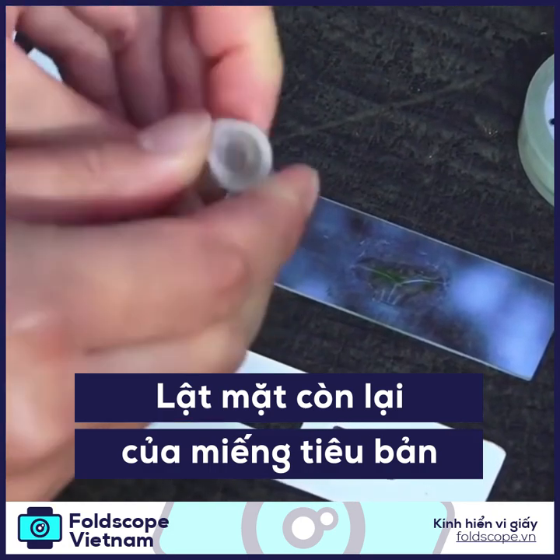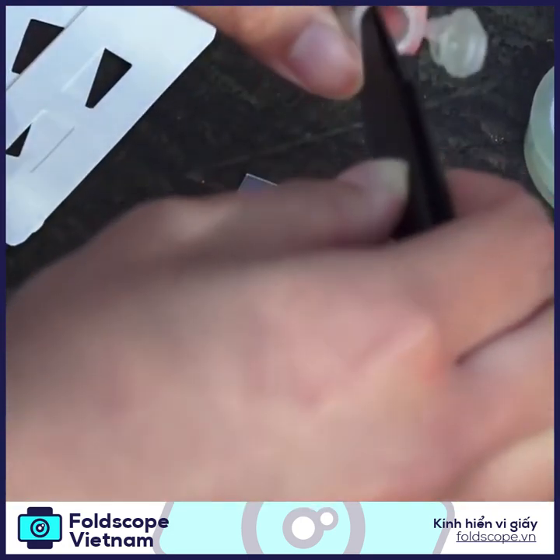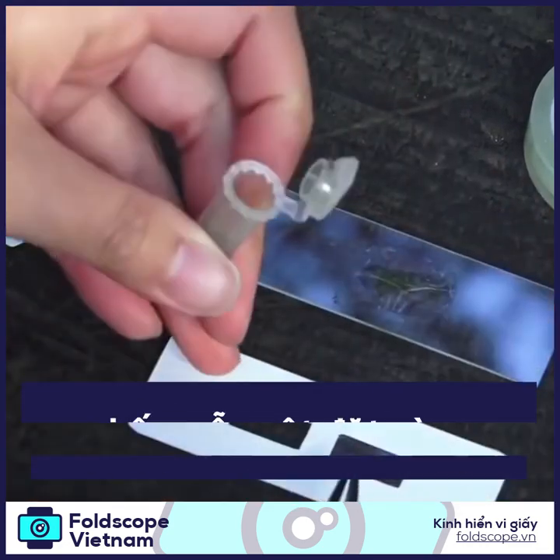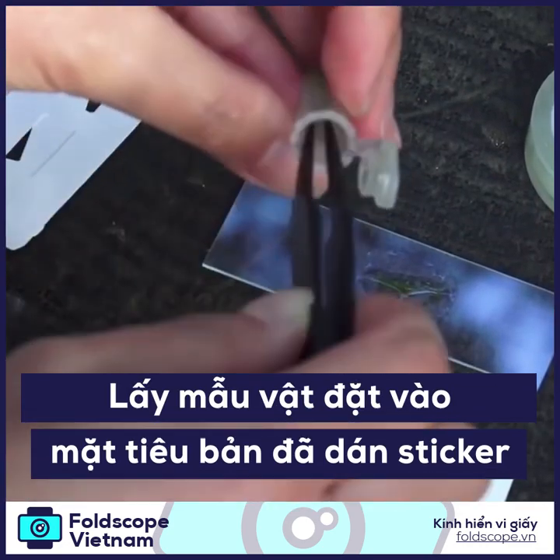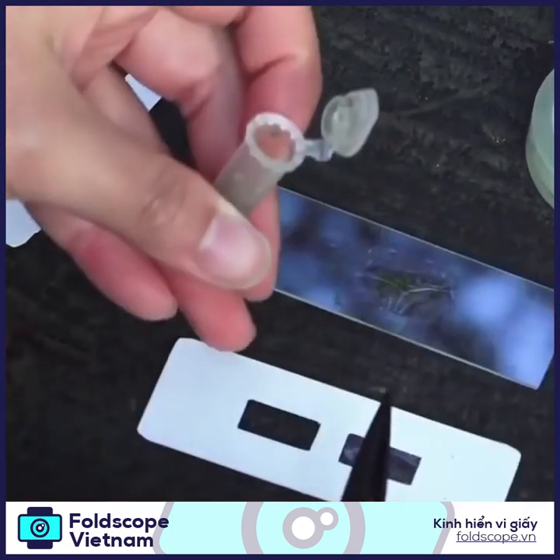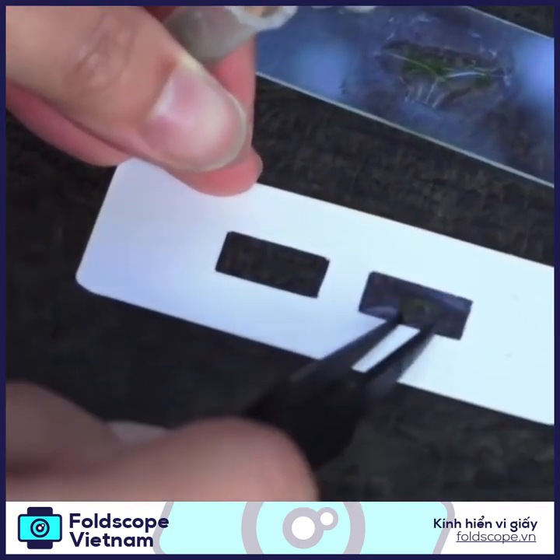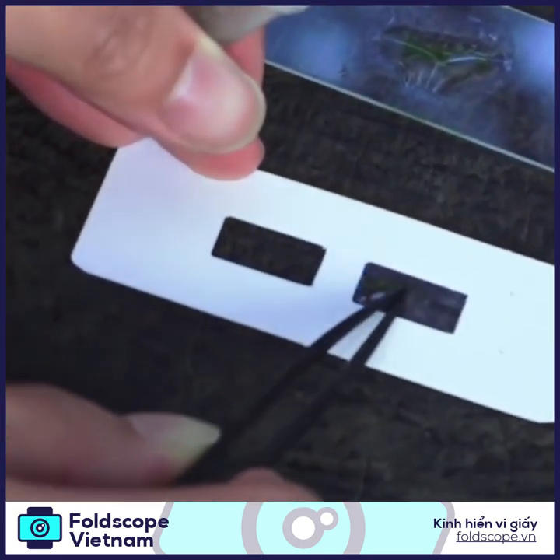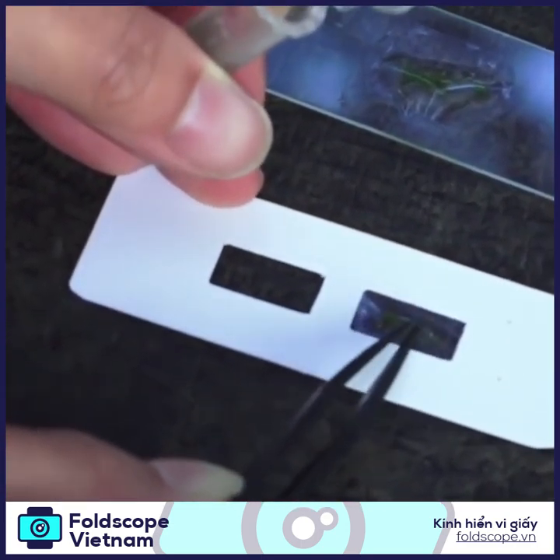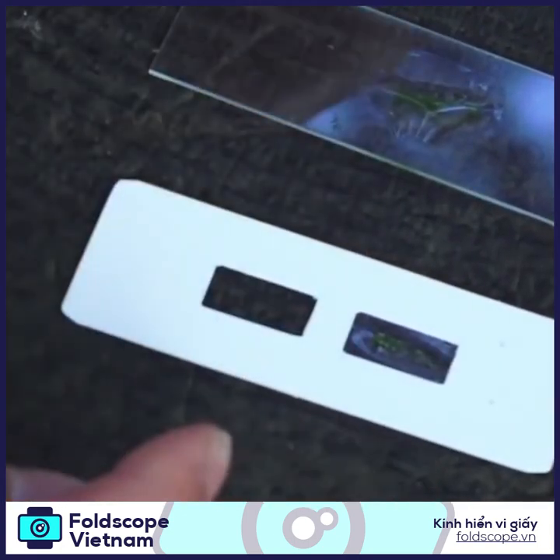Again, place some samples that you have — and this could be anything from leaves to some pond water sample. Just a tiny bit will give you a magnificent world to explore.